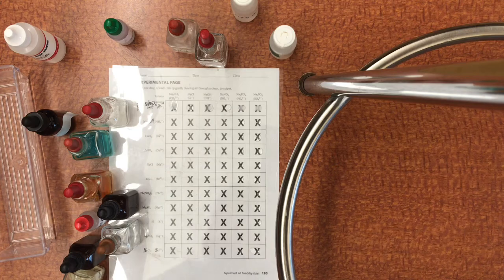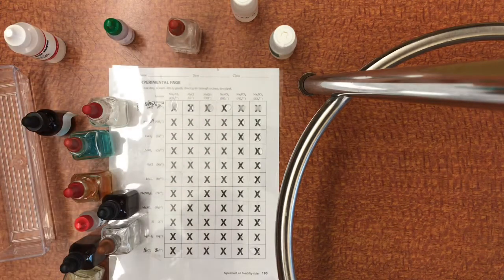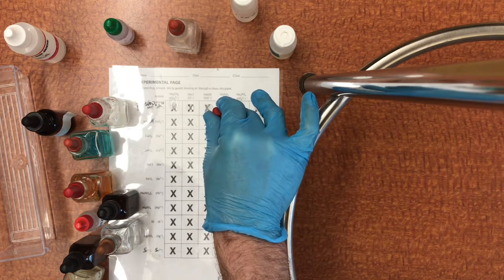I'm just doing this on top of a transparency so that if I need to, I can just wipe it up and it won't cause trouble.